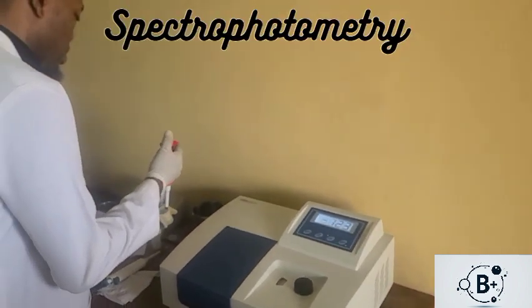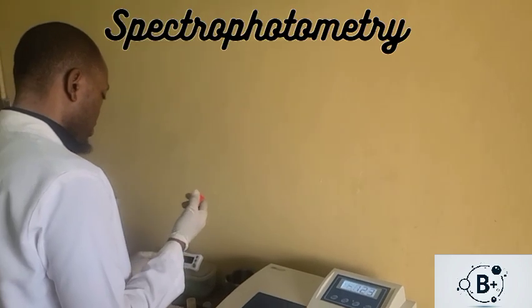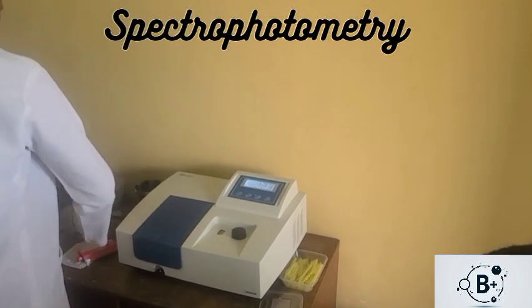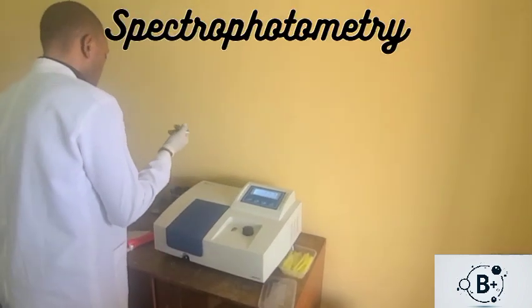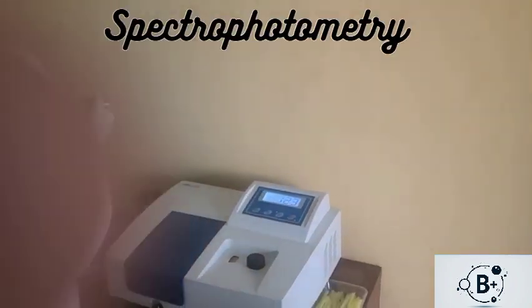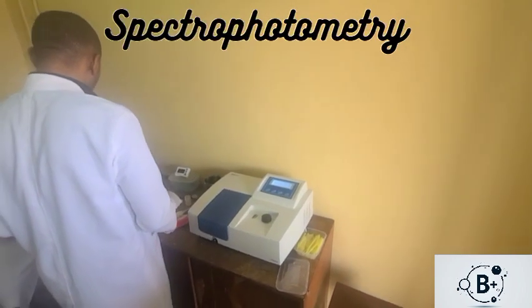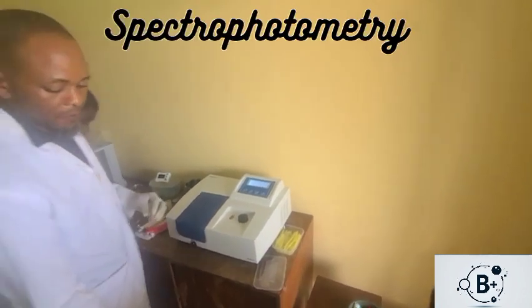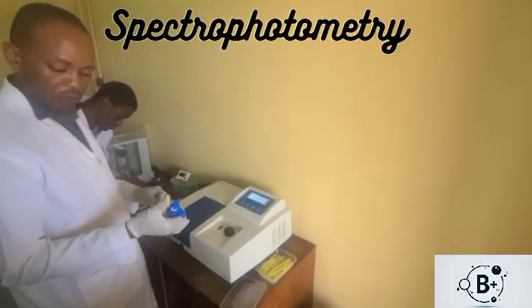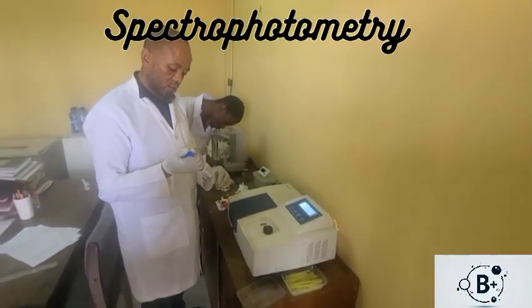So I add the first reagent and take the second reagent, and so with adding the buffer, phosphate buffer. So we add the test samples.